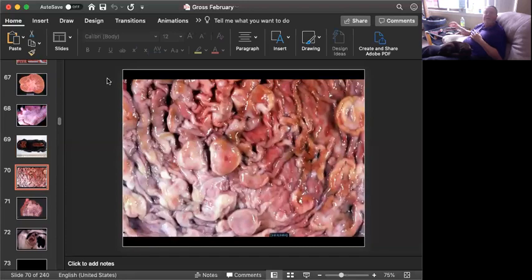Slide number 8 is tissue from a dog. Can I have a morphologic diagnosis? Okay, time's up. We're looking at the stomach. Some of the things going on: it's very red, you have what appears to be bile staining here, and then you have nodules within the rugae of the stomach. One's been opened for you. You can see that it's full of cells. And when you see this, this is gastric lymphoma in the dog.